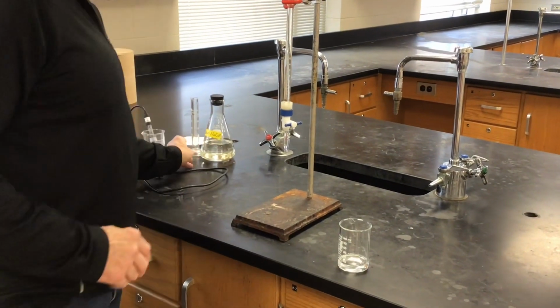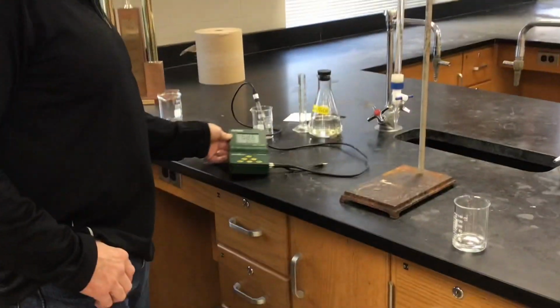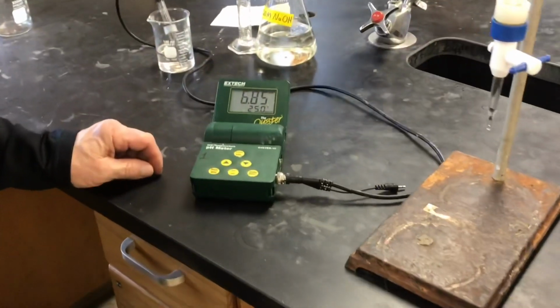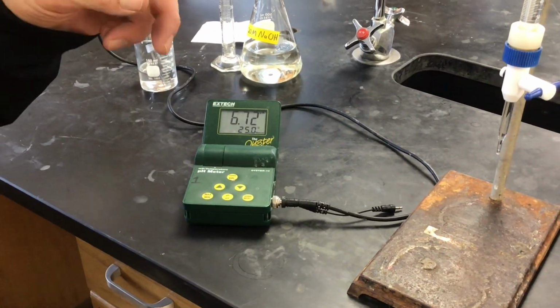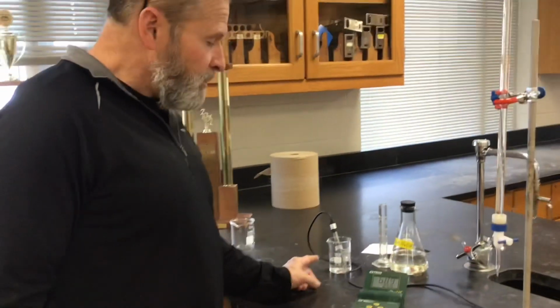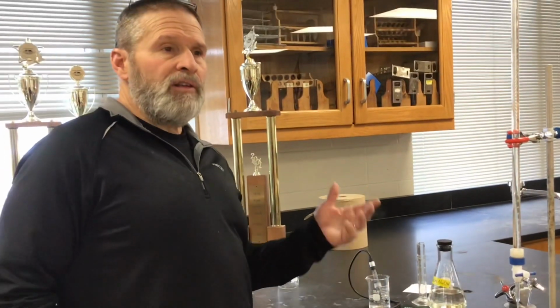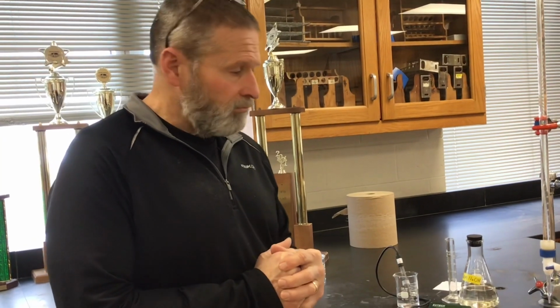And instead of using an indicator, like we did earlier in the year, we're using a pH meter this time around. So the idea is that we're going to add some NaOH, we'll record how much NaOH we've added, and we'll let the pH meter tell us what the pH of the solution is. So you're going to end up with data that is volume of NaOH added versus the pH in the beaker. In the lab write-up there's a data table there so you can record data if you'd like as we're creating.